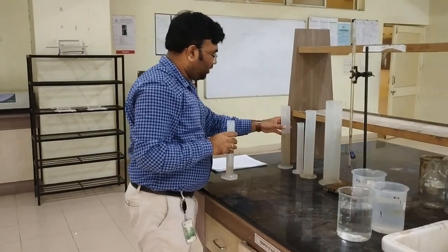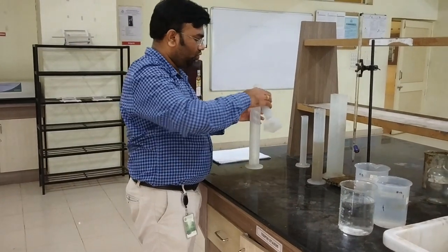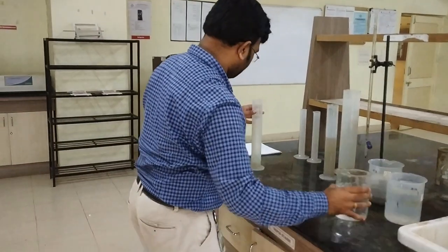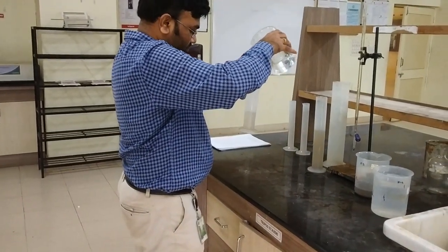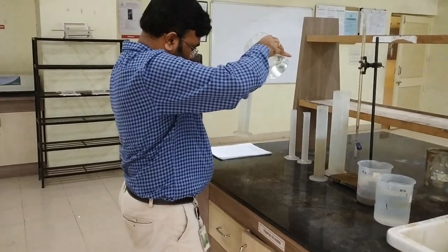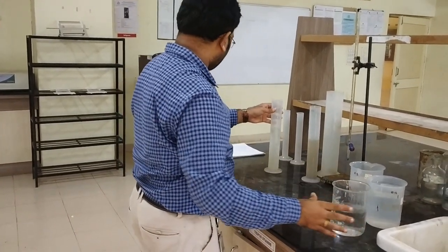We have extracted 25 ml, and now we are going to dilute it to 250 ml. We have diluted it to 250 ml.